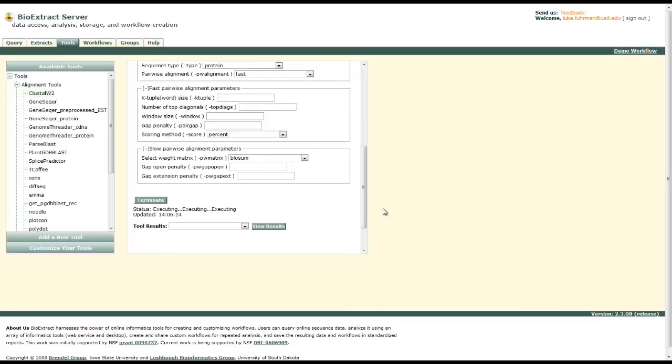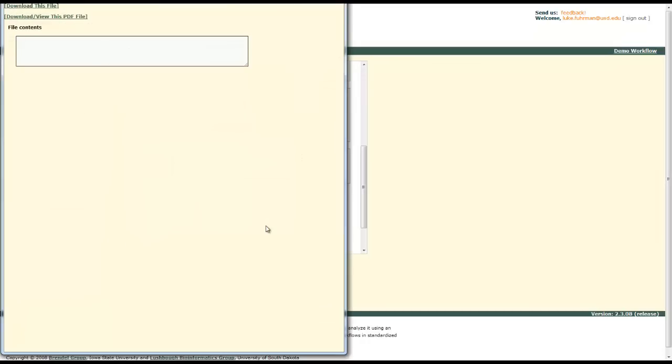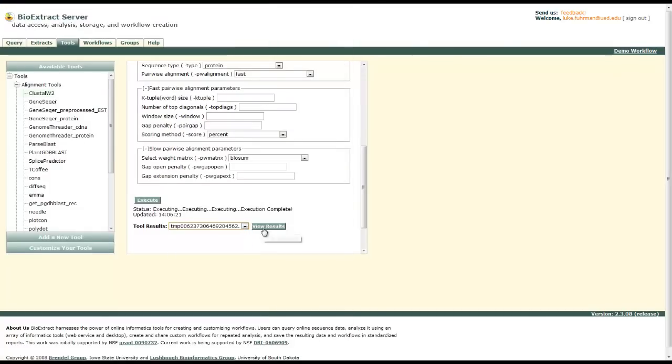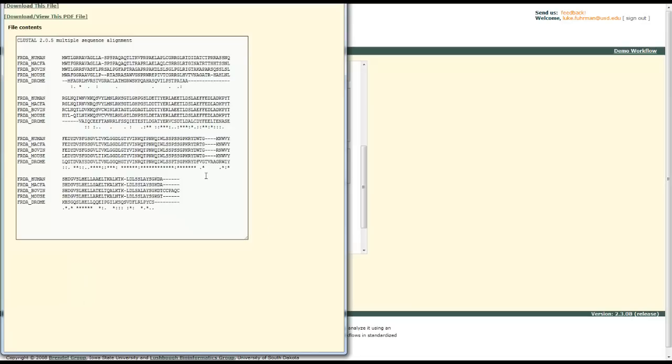Execute your tool. This will line up our sequences that we've just found using BLASTP. We can view our results. Here we go. There it is. Sequence alignment.